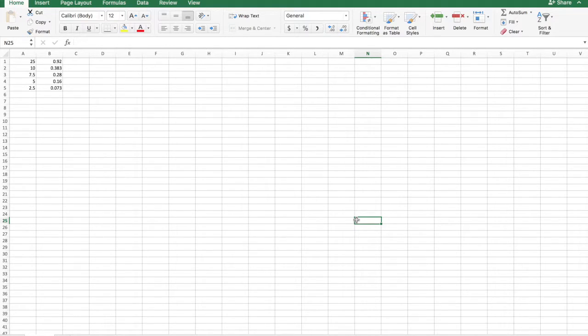But in order to do that, what you first have to do is relate absorbance to concentration, because what you're going to be measuring every 20 seconds is absorbance, but what we care about is concentration. The first thing you're going to do: I've already written in my data right here. Here are the different concentrations that you created, and these are the absorbances that I measured when I did it myself. And so I'm going to create a Beer's Law graph.